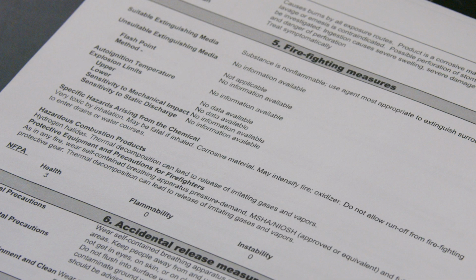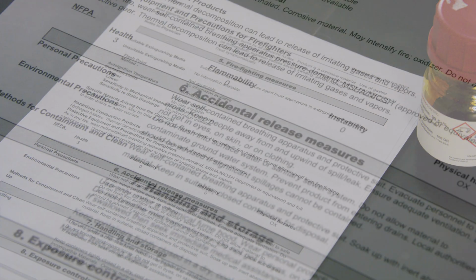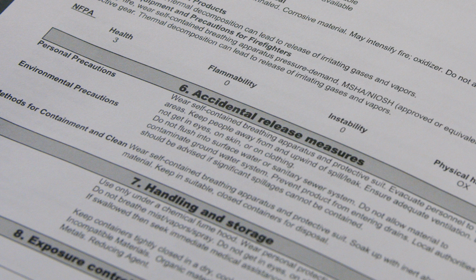Section 5 covers firefighting measures. It tells you how to extinguish fires caused by the chemical and lists any specific firefighting equipment or instructions. Section 6, Accidental Release Measures, will guide you on how to handle spills or leaks. This is critical to minimize the danger of an accident spreading.